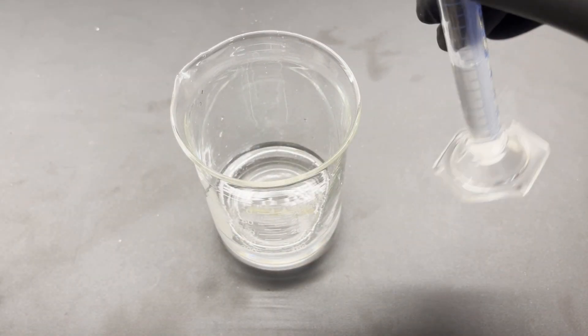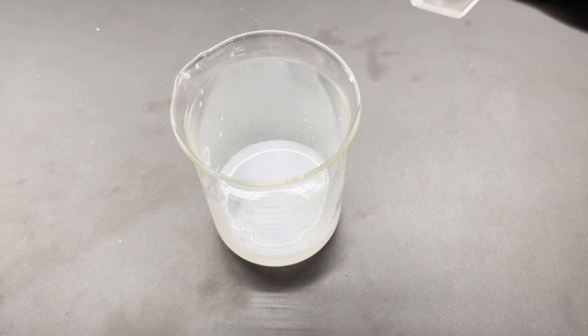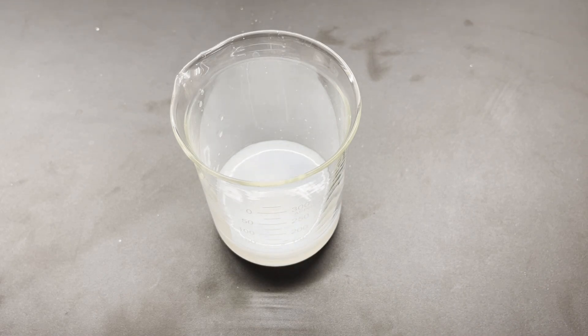100 ml of the saturated table salt solution is transferred to a clean beaker and then 10 ml of the prepared silver nitrate solution is added.